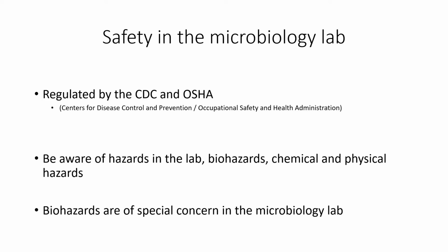So let's go ahead and talk about safety a little bit more in the microbiology lab. It is regulated pretty closely by the Centers for Disease Control and Prevention and also OSHA, which is the Occupational Safety and Health Administration. They have some really good websites, so you might want to refer to the CDC website, which is www.cdc.gov, for information that you might be looking up as well.